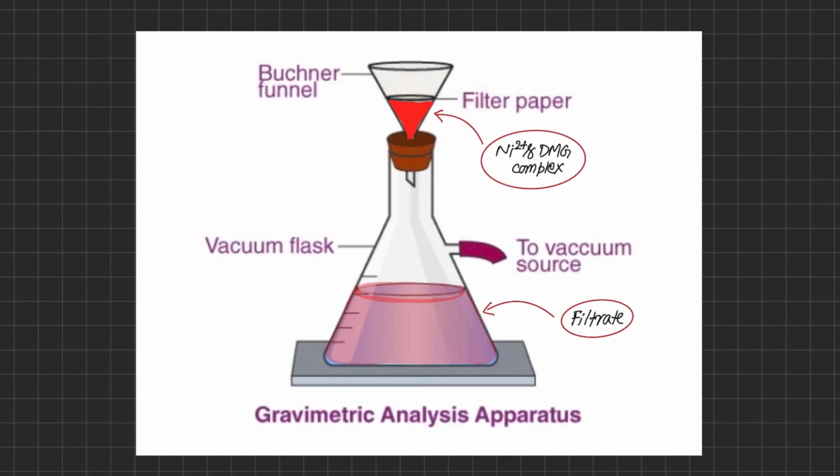After collecting the precipitates, we will dry them, and after that we will weigh them. The drying procedure is very necessary here, because we cannot over-dry it, or the complex can be decomposed, and we cannot do an incomplete drying either. In case of incomplete drying, we will weigh the precipitates greater than their original weight, because the weight of the filtrate will also be present.